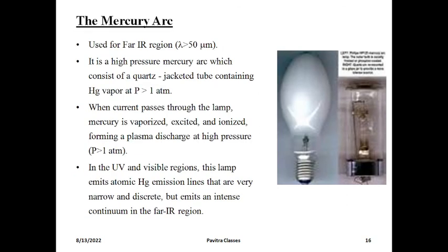Next is the mercury arc lamp. This mercury arc lamp is usually used for the far IR region. So it is pharmaceutically not used. This source is also not used in pharmacy.